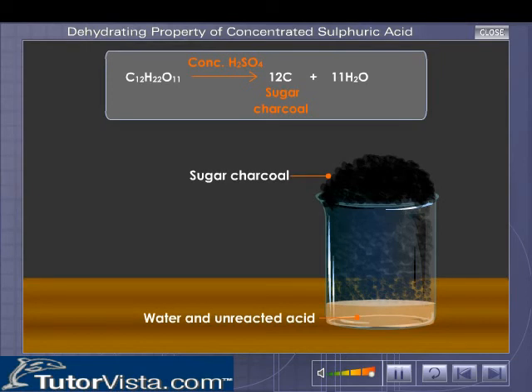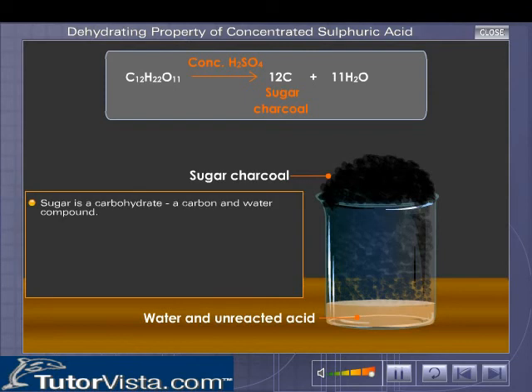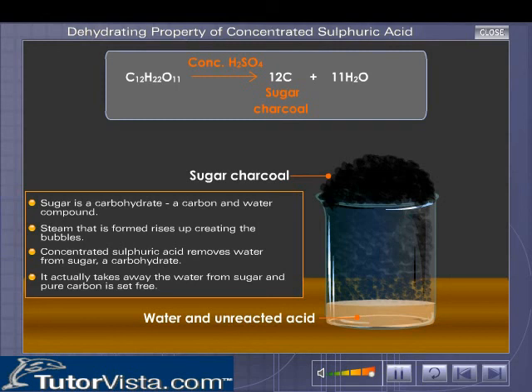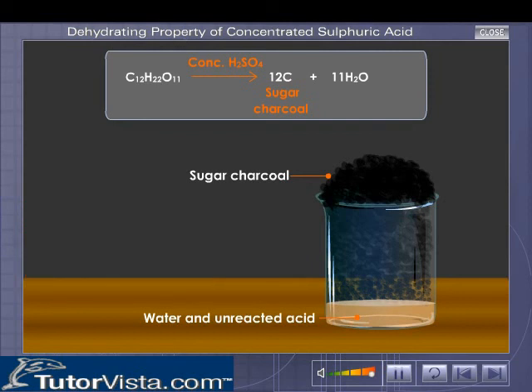Now why does this happen? Sugar is a carbohydrate — a carbon and water compound. Concentrated sulfuric acid removes water from sugar. Steam that is formed rises up, creating the bubbles. It takes away the water from sugar and pure carbon is set free, so the mixture turns black.